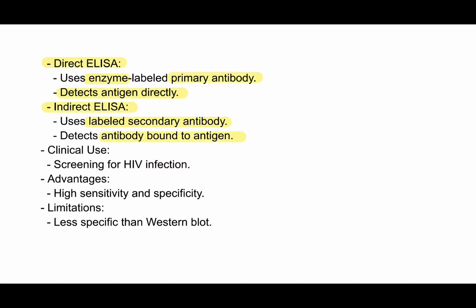Now we will discuss the clinical uses of ELISA. ELISA is basically used for screening for HIV infection. There are some advantages of the ELISA test: high sensitivity and specificity. These are two advantages of ELISA. Its limitation is that it is less specific than the Western blot.